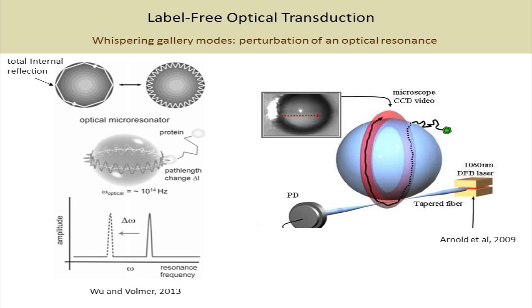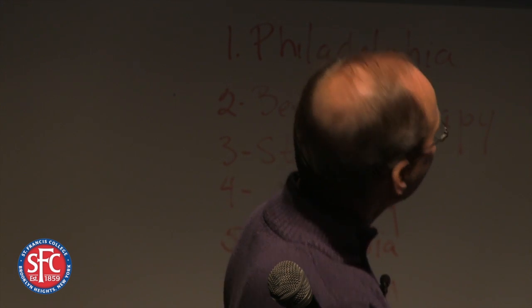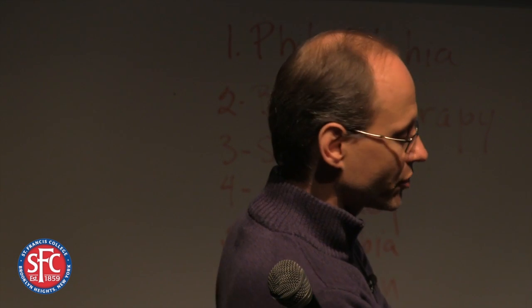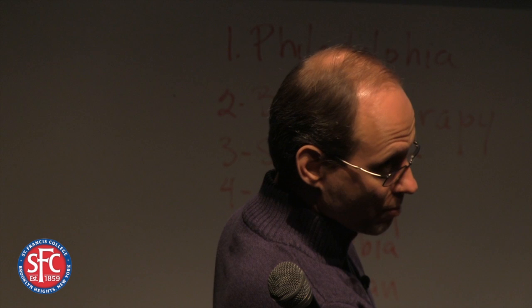And I can use those electrodes to apply an electrical field across the crystal. And if the material is piezoelectric, what it means is that the material is going to move. So I apply an electrical field, and that makes the crystal deform. It'll move like this. It'll kind of shear. That's a shear deformation is what we call that. And I can apply that potential at different frequencies. So I can shear it, and I can hold it, or I can shear it and reverse the polarity to cause it to go back.